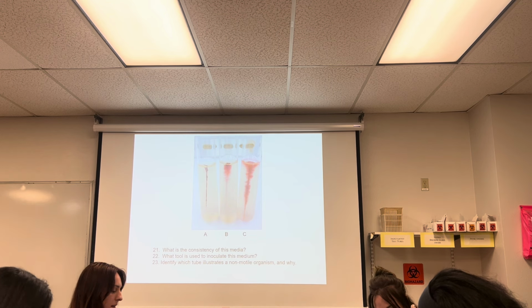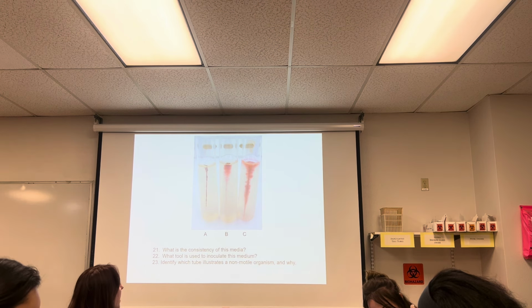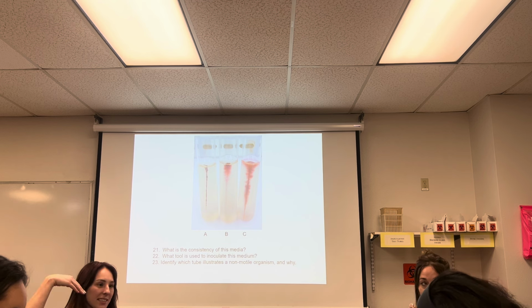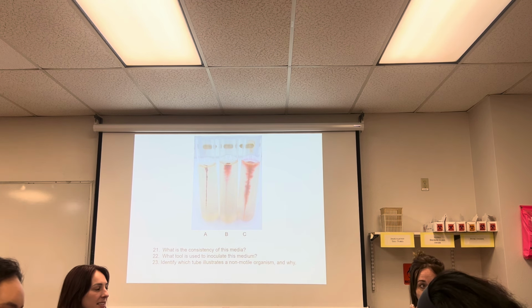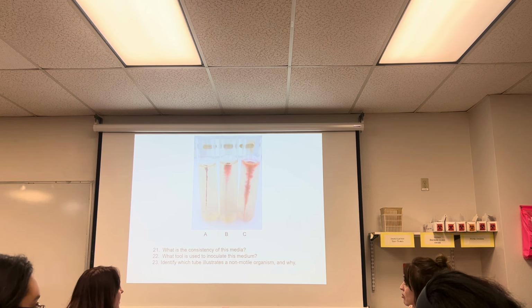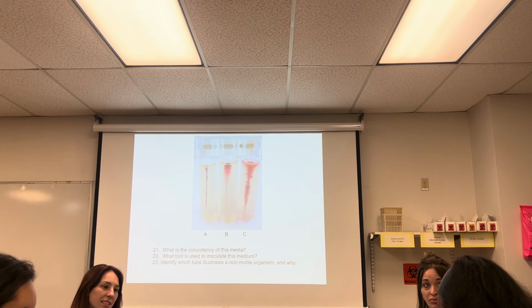Okay? Identify which tube illustrates a non-motile organism. A. Why? It's not fuzzy. I like that. That's fair. But the other one, it's only growing at the site of inoculation. All these are fuzzy. Now, for this class, you can use fuzzy or not fuzzy.